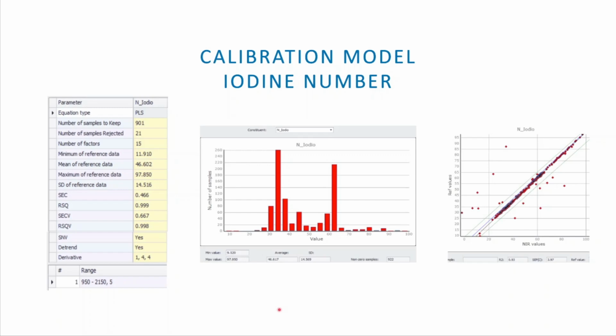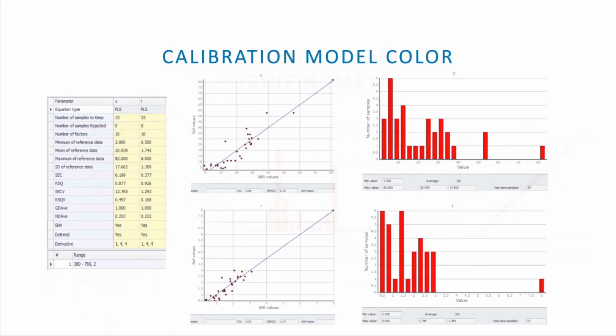Please notice the high number of samples. We are around 900. In the case of color calibration, samples are few, and the database must be populated. This is a non-conventional approach in the VIS range, but it pays. Thanks to samples with high red and yellow index, also these two calibrations get better performances, maintaining high correlations instead of searching the lower standard error of calibration.